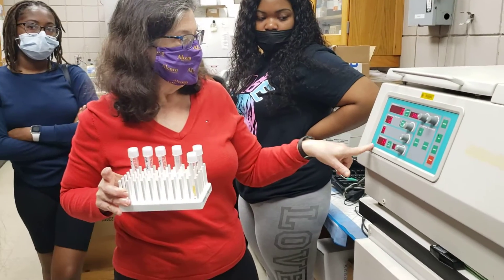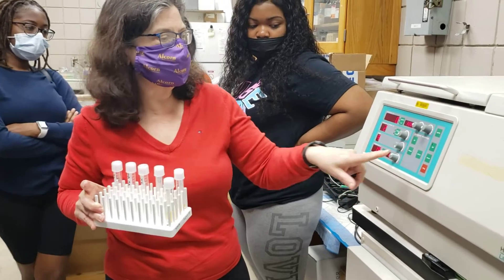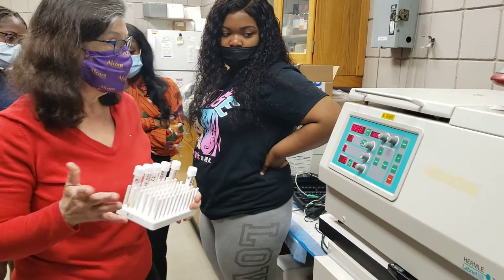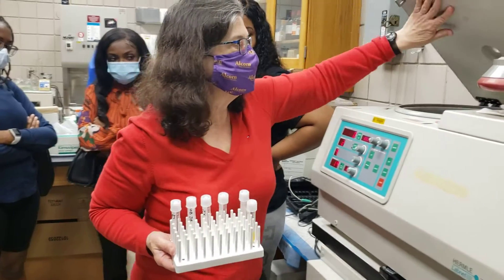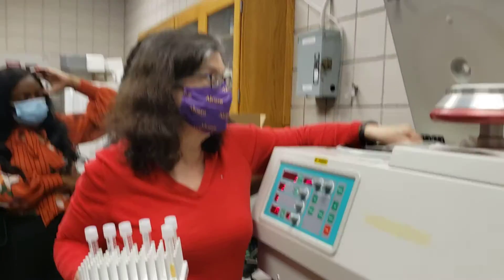We're going to centrifuge the yeast cells to separate them from the substrate. Then you open here. This is what is called the rotor — R-O-T-O-R.